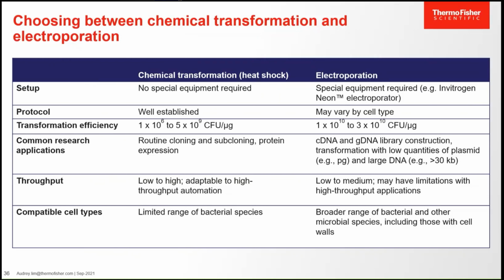Okay, electroporation requires an electroporator, which limits its scalability, and it will require some protocol optimization and also some skill. However, electroporation will give significantly better transformation efficiency than chemical transformation. Electroporation is also compatible with a wide range of bacterial species, including those with cell walls.